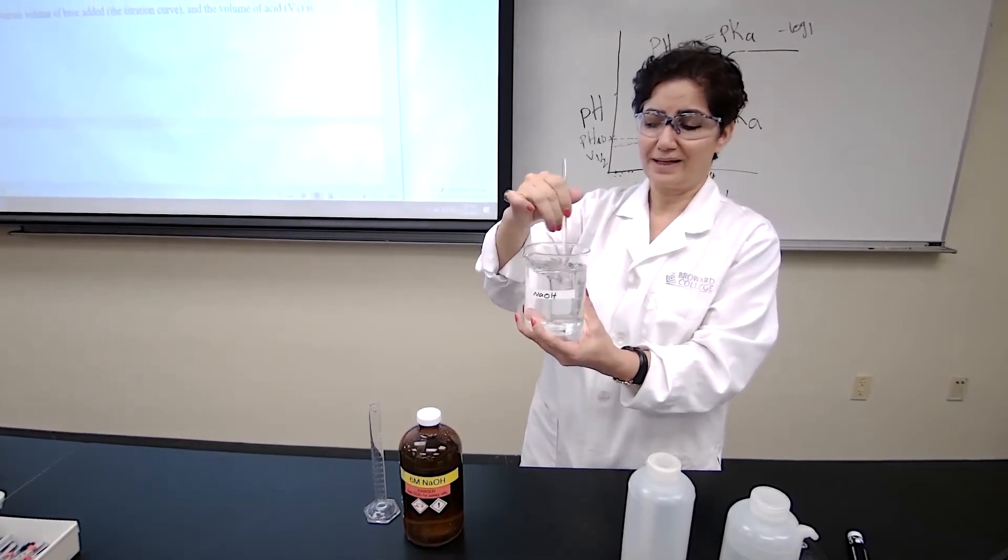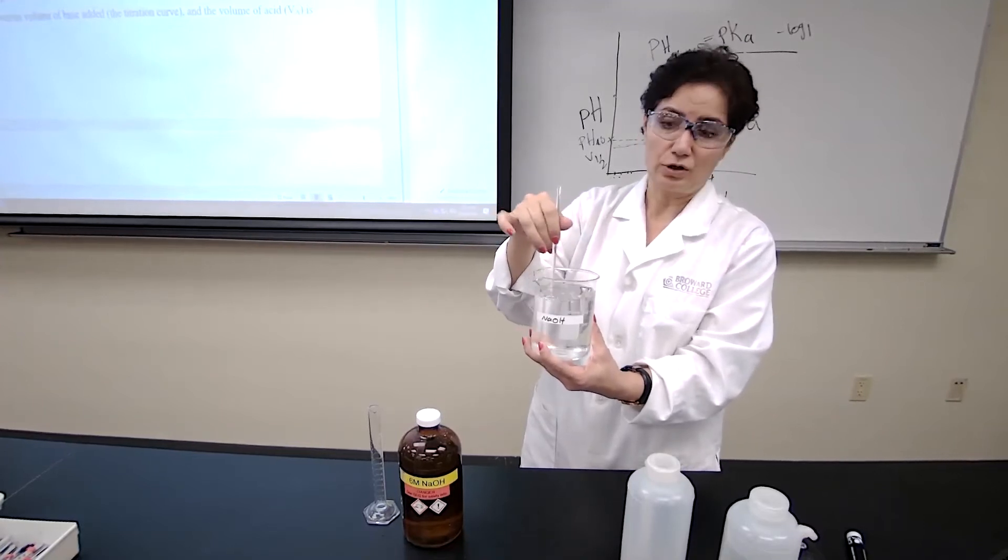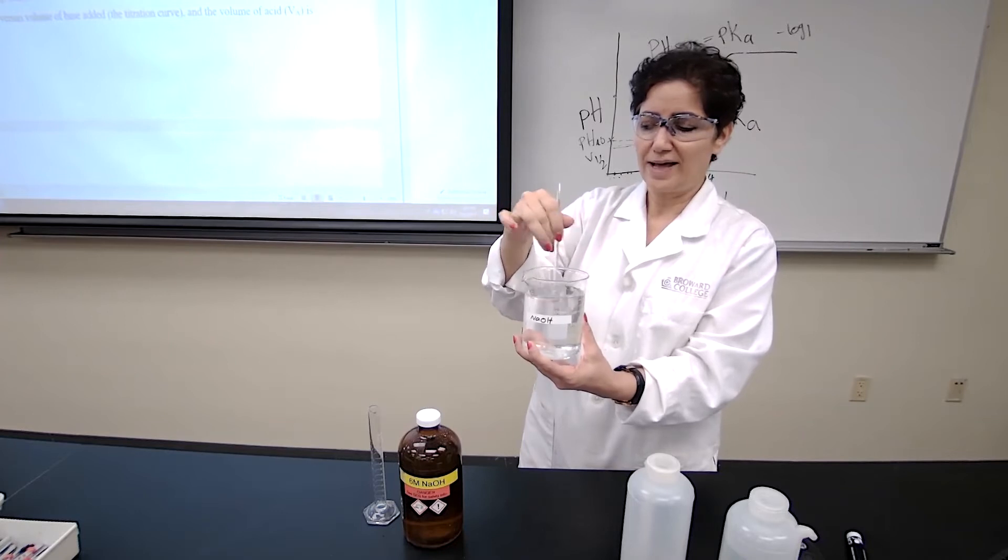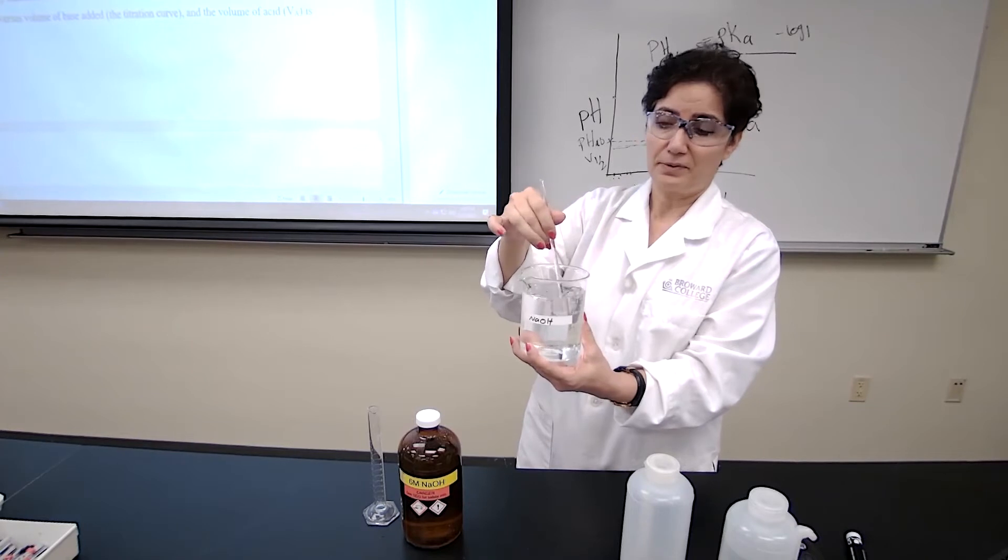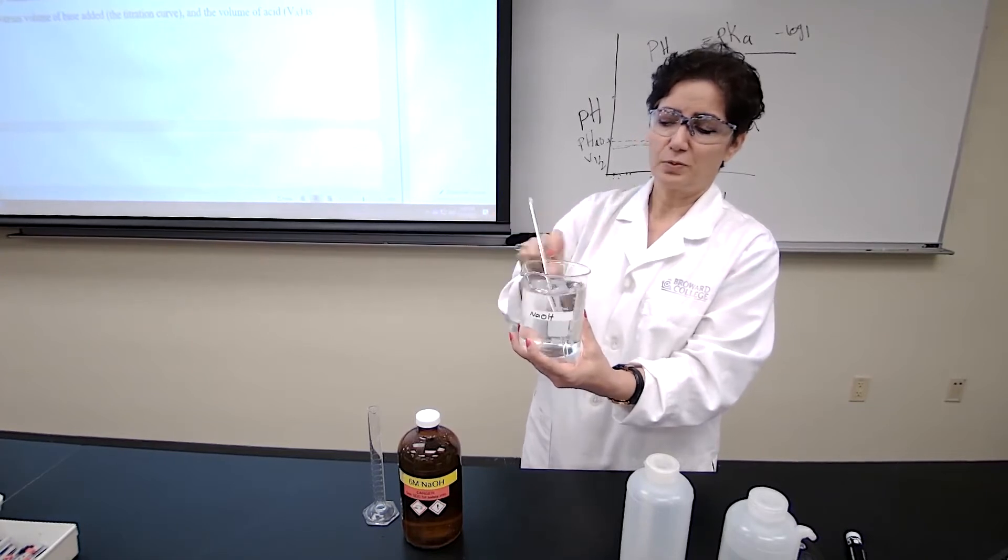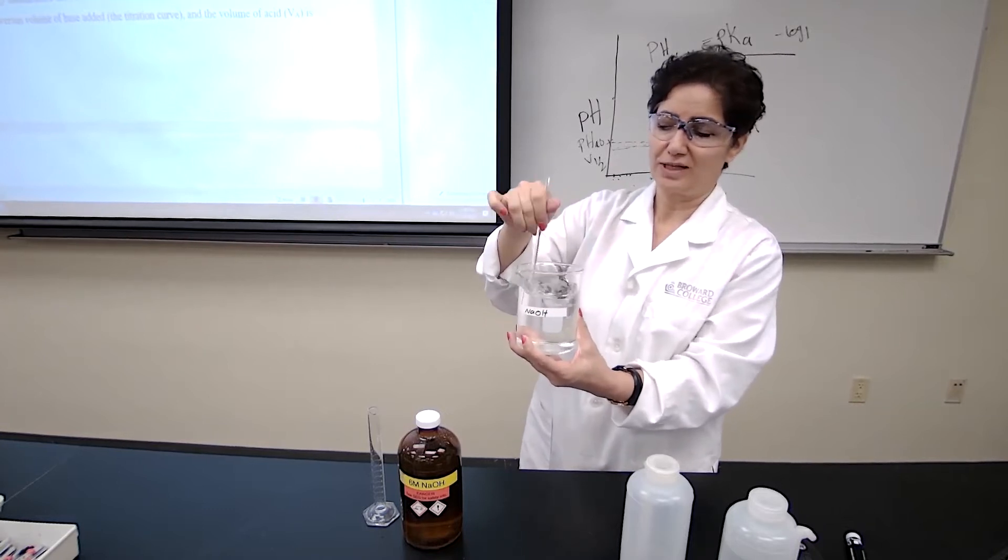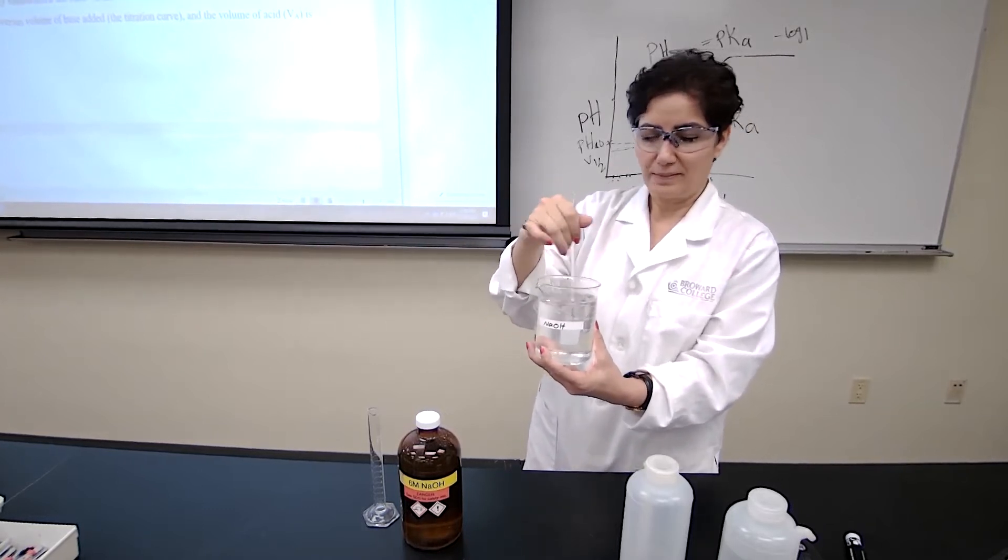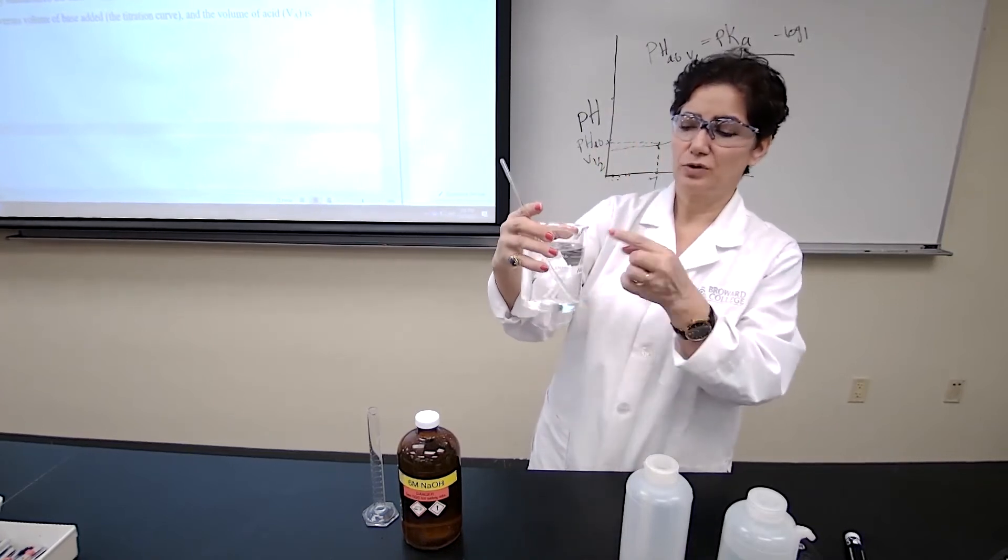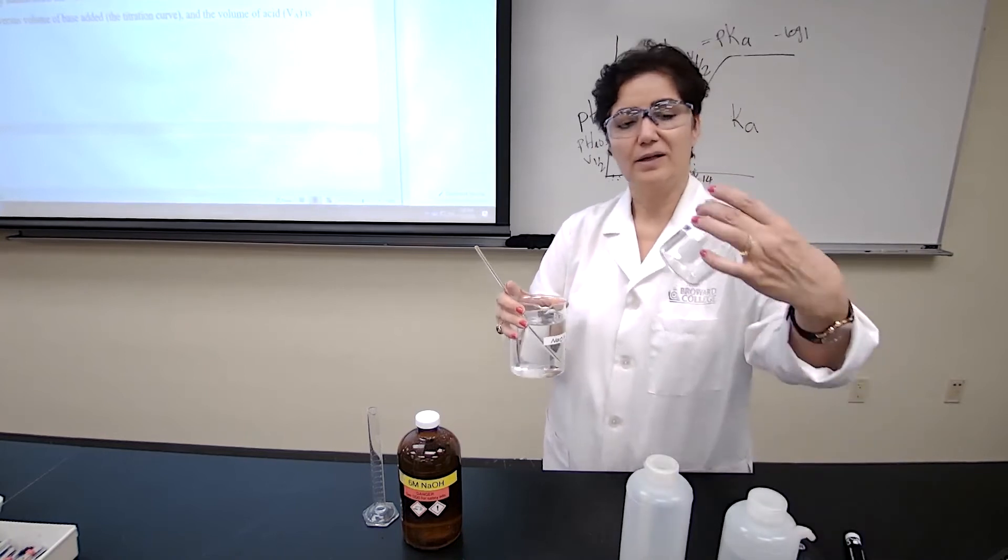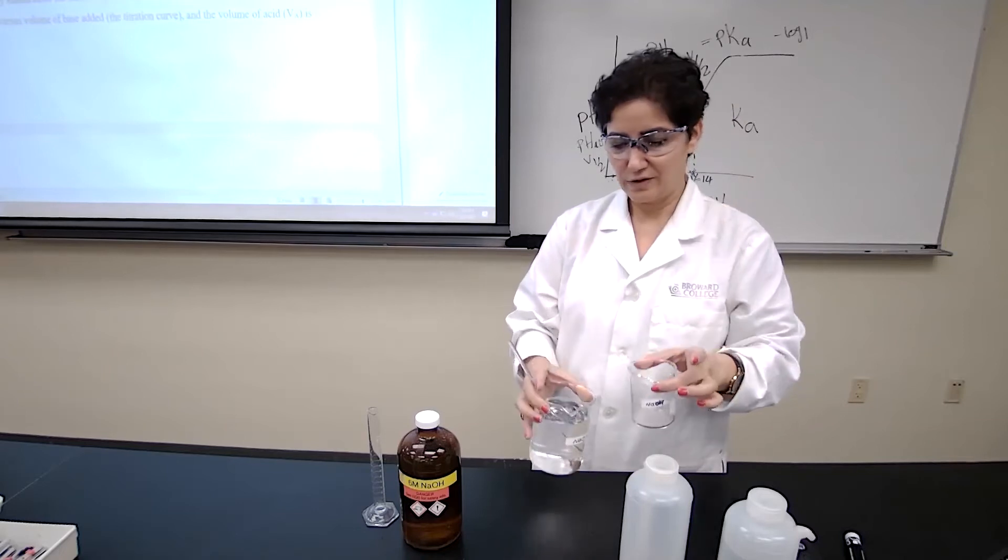I would use either magnetic stirrer or stirrer with the stirring rod for about a minute or two to make sure I have even solution and when I'm filling up the burette with this solution, the first portion that I'm taking is not more dilute than the second portion. So I have to make sure that my solution is even. I have the solution going to continue mixing and I would transfer to a smaller beaker. I would fill up the burette for you.